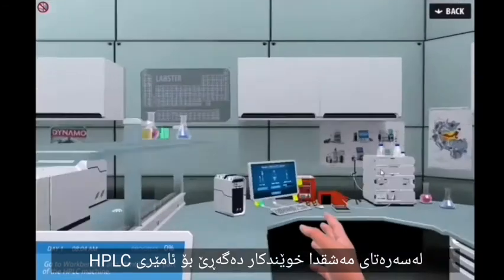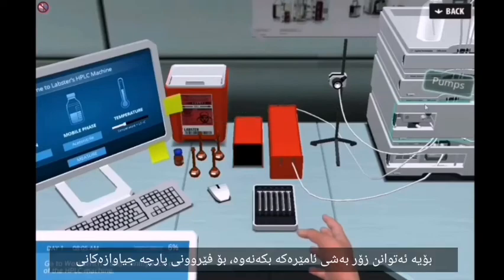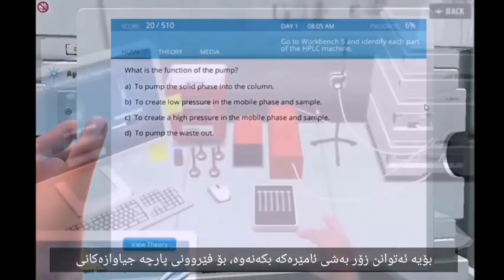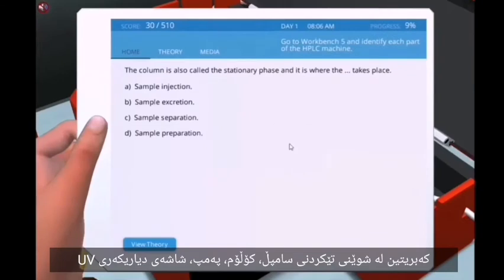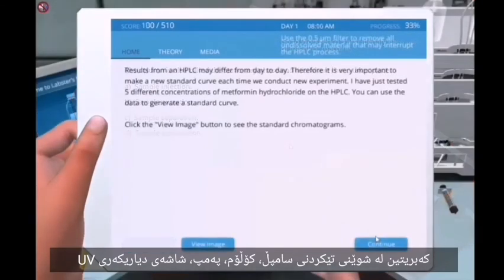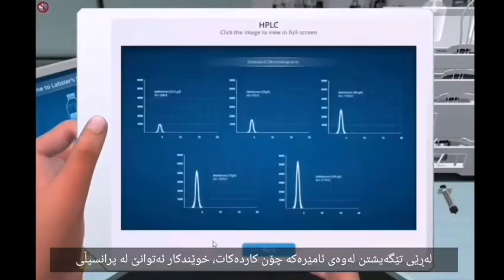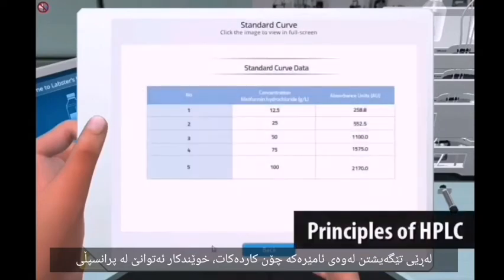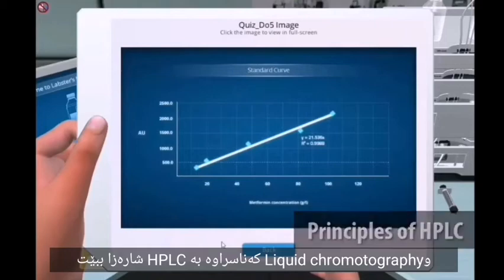In the first part of the exercise, students explore the HPLC machine. They can open various parts of the machine and learn about the different components, including the sample injection station, column, pumps, and UV detector. By understanding how the machine works, students will be able to understand the principles of liquid chromatography, specifically HPLC.